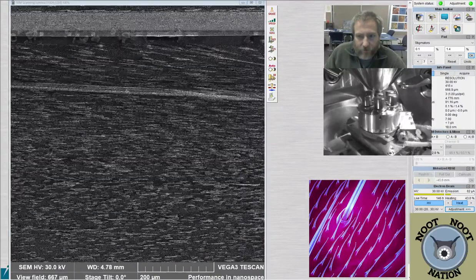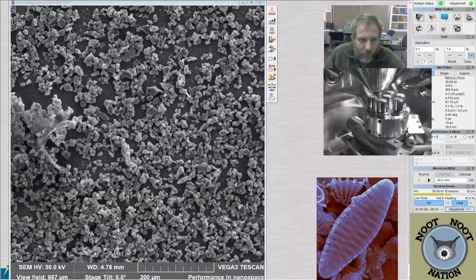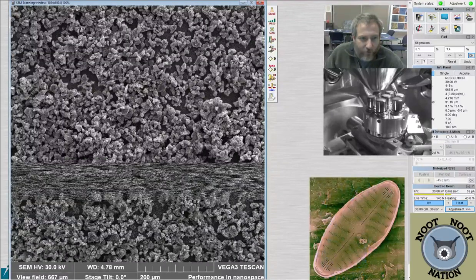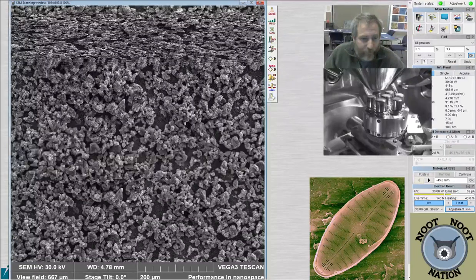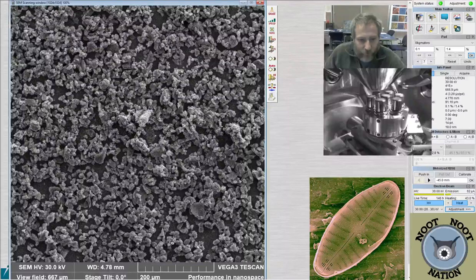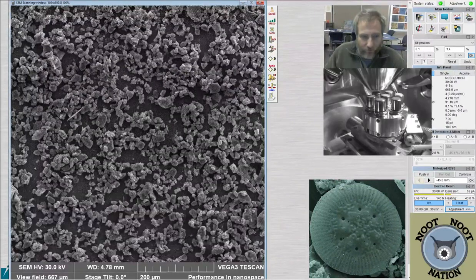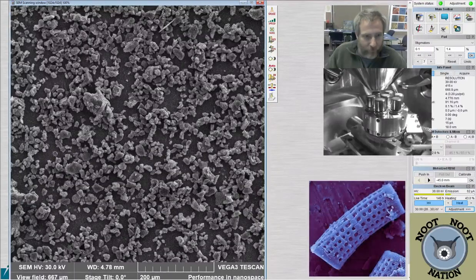Let's try running over to sample 6 and see how dense the sample is, in an attempt to get some diatoms present on it. Sometimes it's challenging to figure out how much material to put on a stub. So Mallory made these for me this morning. And see how much of this stuff is actually just silt, right? It's not a lot of diatoms present.